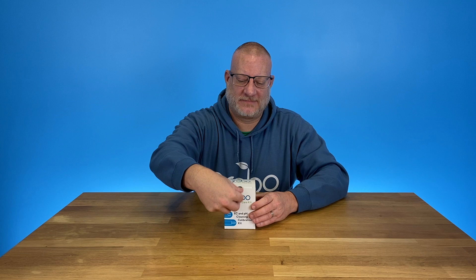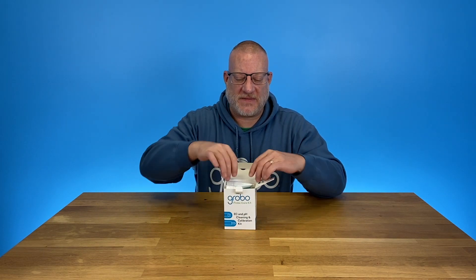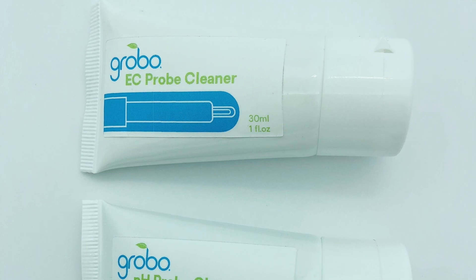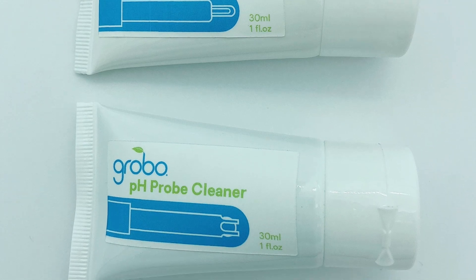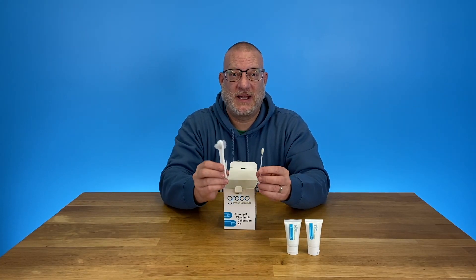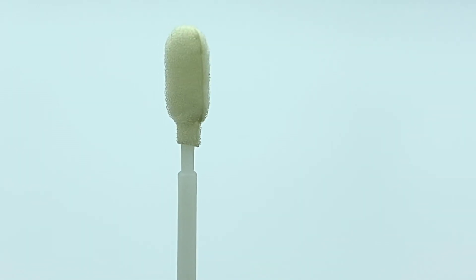Let the unboxing begin. So inside this kit you're going to find two solutions — these are soaps for cleaning your EC probe and your pH probe. We've also got two tools to help you clean: this one is for cleaning your pH probe and this one is for cleaning your EC probe.